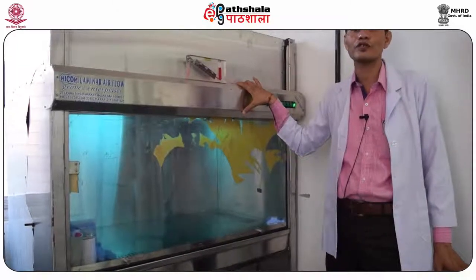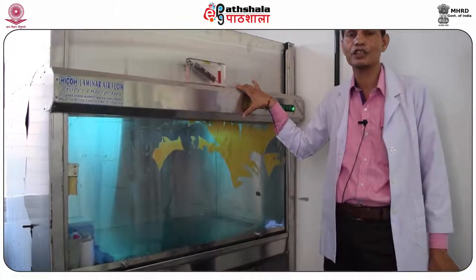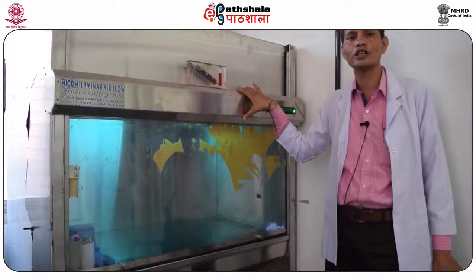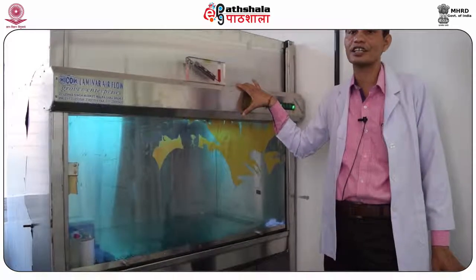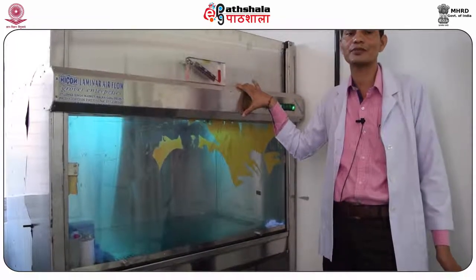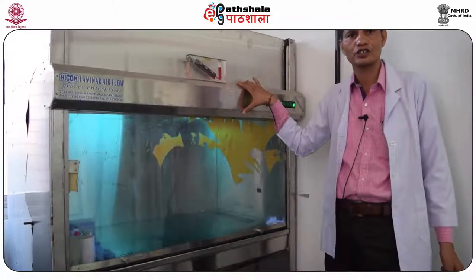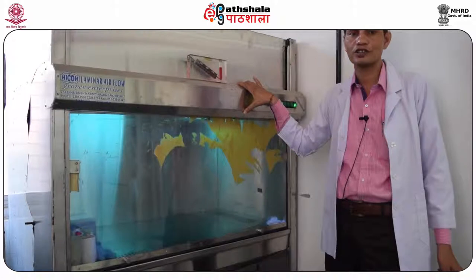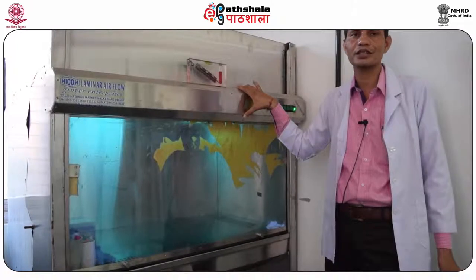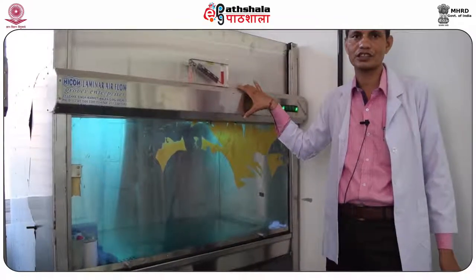But the cost of laminar flow is much less compared to a biosafety cabinet. Therefore, this depends upon the type of work in your lab. If you are working only with non-infectious matter and cell lines, you can use laminar airflow. If you are dealing with infectious matter, like virus culture or any other such activities in animal cell culture, then a biosafety cabinet is required. As per biosafety guidelines, you should have biosafety cabinet facilities to culture that pathogen.